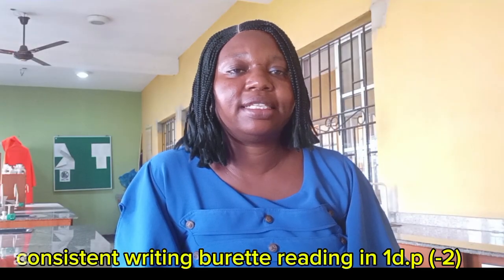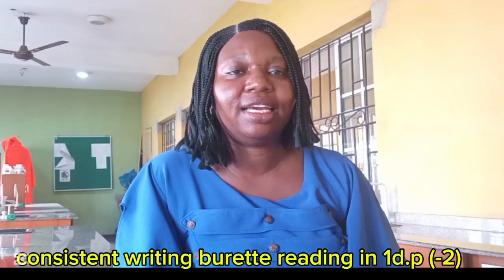The 5th thing that can make your mark be deducted in chemistry practical is not consistently putting your burette readings in 1 decimal place.